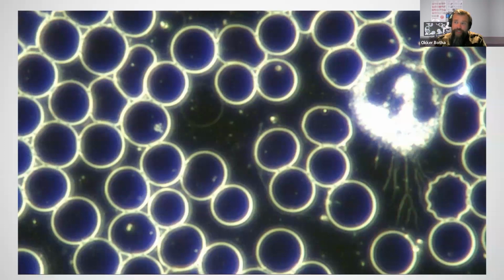It's a very high level of magnification, and often a bit too high for the normal identification of anomalies that we usually look for in live blood analysis, but really useful to have when we're looking at microbes and various pleomorphic growth forms as well, because those tend to be quite small and very faint. So we can actually see in this image on the right-hand side there, this bright structure here is a white blood cell, and we can see these strange root-like growths extending out of the cell at the bottom there. So these are changes that indicate some parasitism. Very important to be able to see this, and really great to get this type of magnification so we're able to see these patterns.